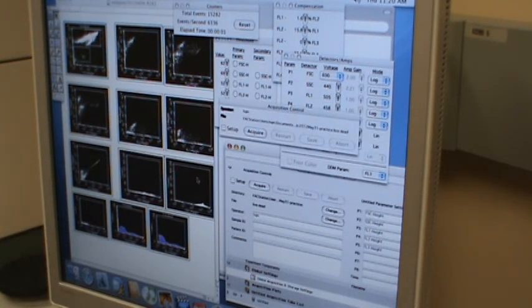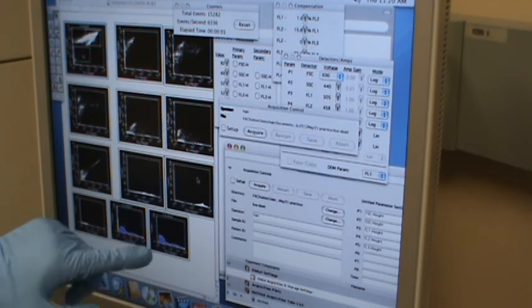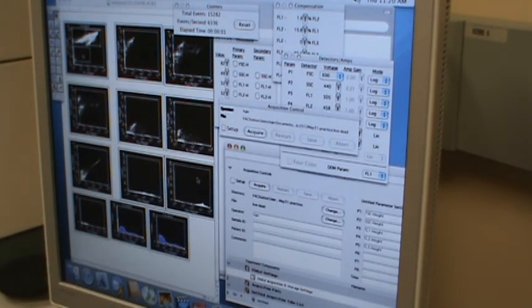Once I'm not running, I put it on standby. For this sample it doesn't matter, but for many precious samples, it may make a difference. So if you look at this peak, it's a broader peak now, and hopefully when we switch to the dead cell, we see a stronger peak there.